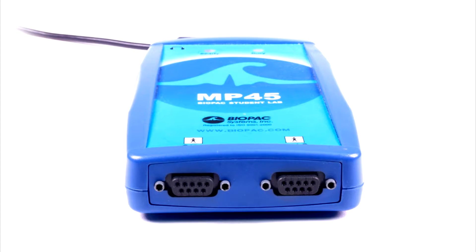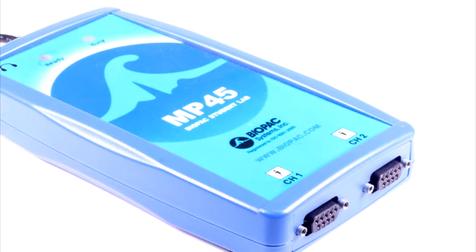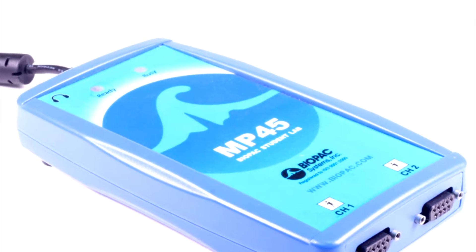With two universal analog input channels, data can be recorded from a wide range of signal sources including electrodes, transducers, switches, and headphones.